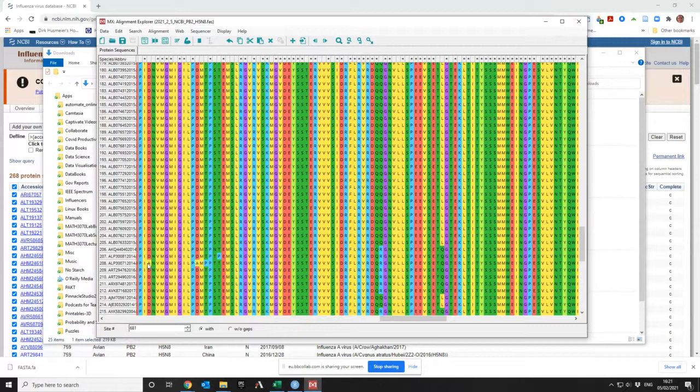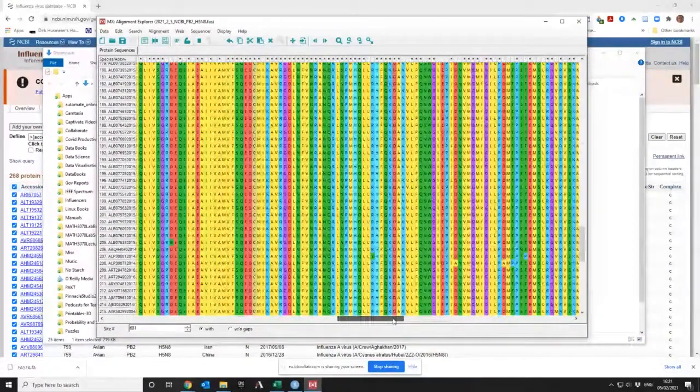I think that somebody's messed up the DNA sequencing at these two positions and called the nucleotides wrong, and that the particular codon, an alanine codon, is close to an aspartic acid codon, and they've just made a mess of the sequencing.